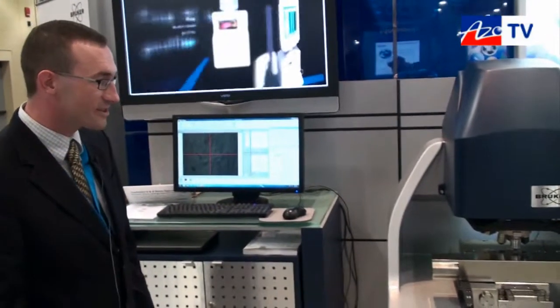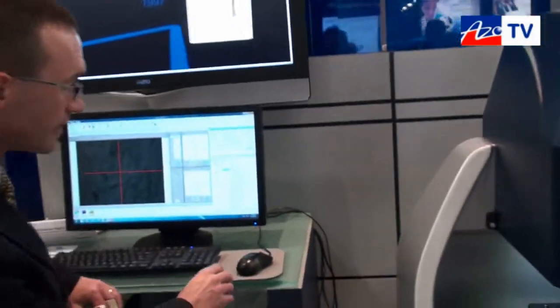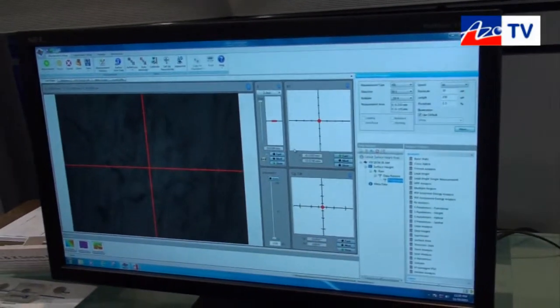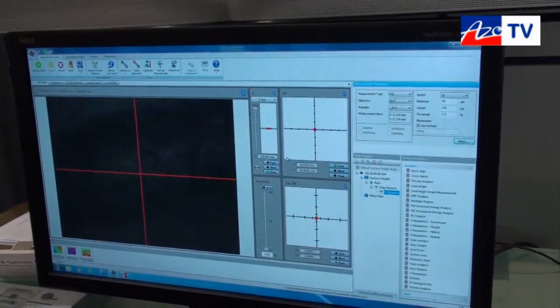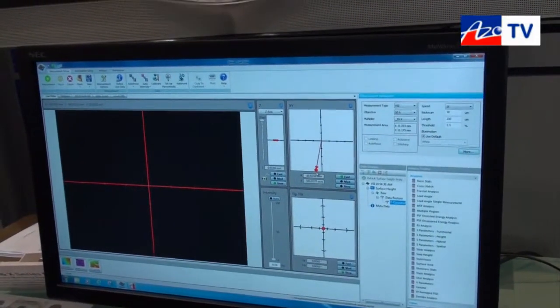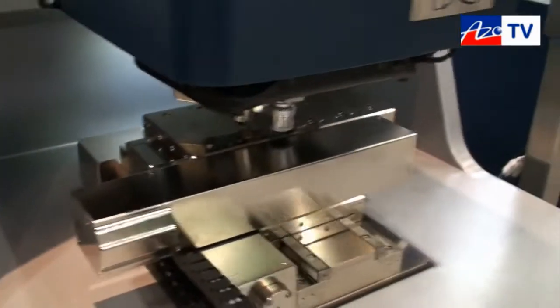If you come over this way, I'll show you the stage motion and what's involved in loading a sample. The stage motion is all motor controlled, and I can simply load a sample and drive the stage back.